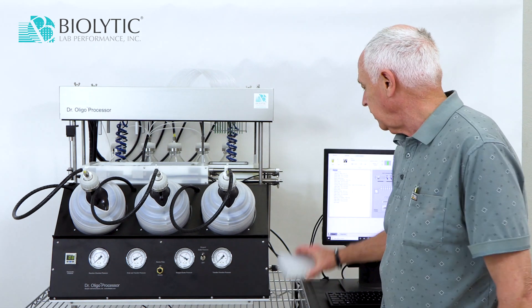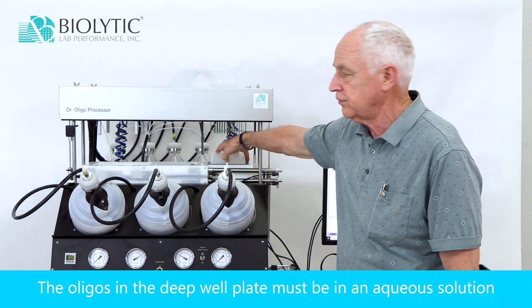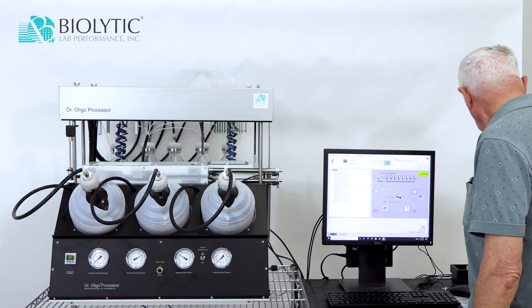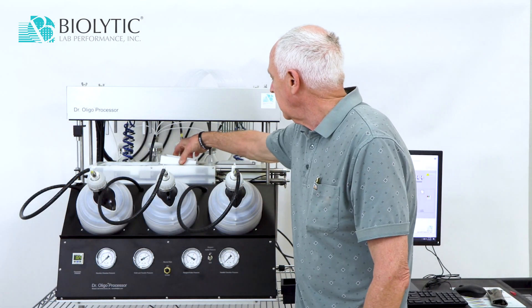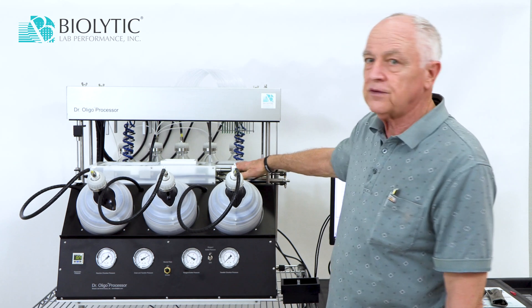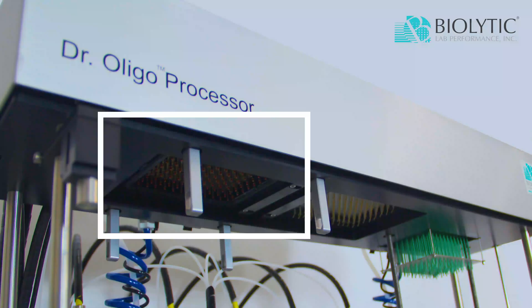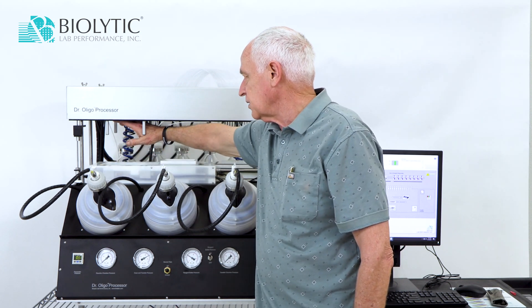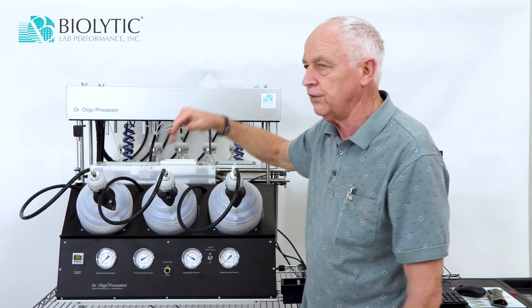On this side is where our transfer station is. This would be a deep well plate that would contain our oligos and would go in here if we're going to transfer them to cartridges. These tubes go down into the bottom of that plate. On this other side, we would have a plate that contains cartridges for purification. This closes down and we pressurize this side, then the oligos move through this tubing and get deposited over here. On this side is a dispense manifold where the reagents from these bottles can be dispensed into the plate from any bottle that we need.